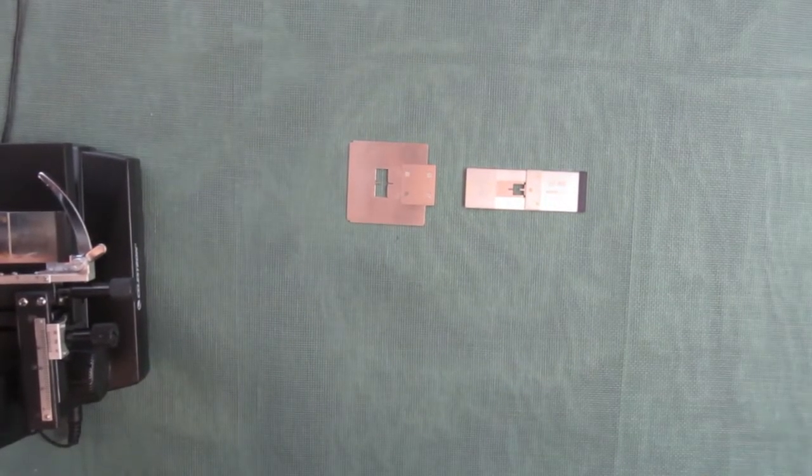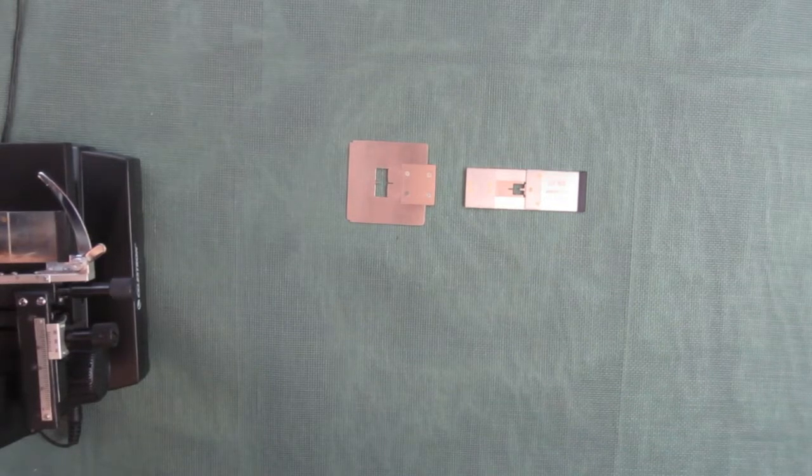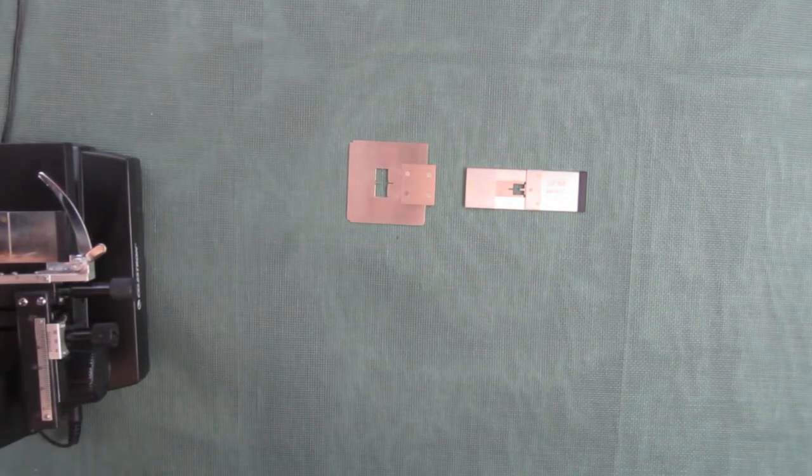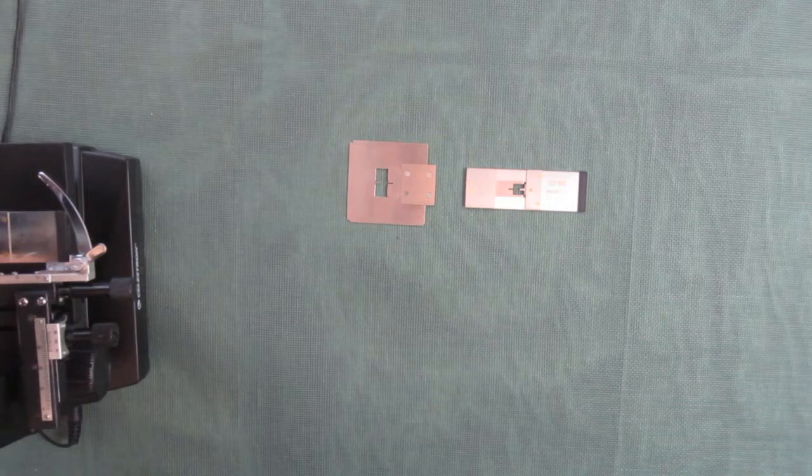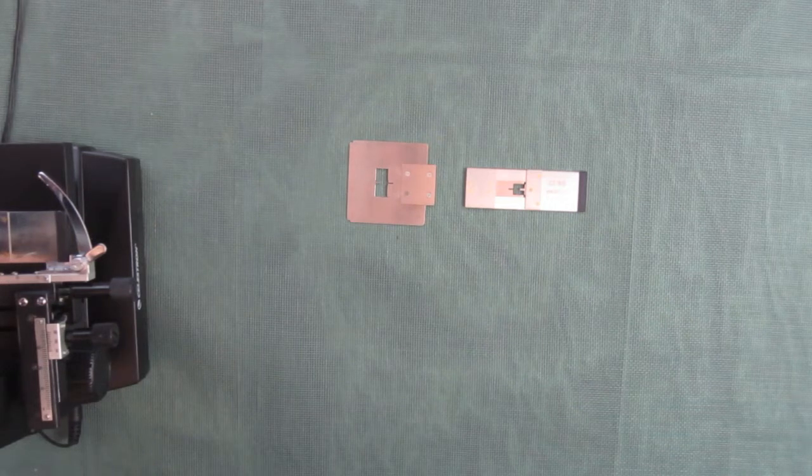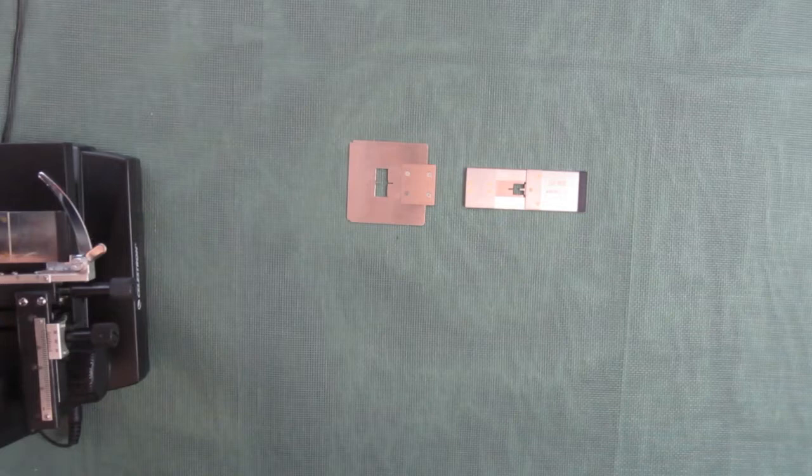Hello all, I'm going to show you the difference between the old quick cross-section plate versus the new quick cross-section microscope slide.